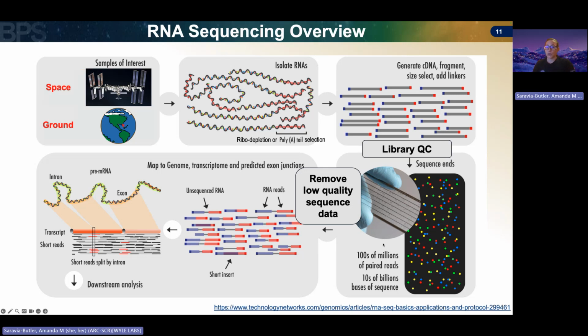Once you're done with your sequencing, the next thing that you are going to do is assess those sequences for low quality sequence data and determine if there are any adapters in there. We did talk about this in the GL4U module set and that hands-on sequencing QC Jupyter notebook at the very end of the GL4U module set. We will review that in this module set.